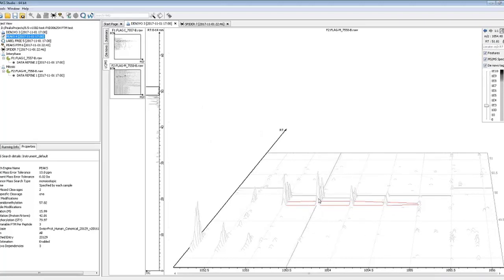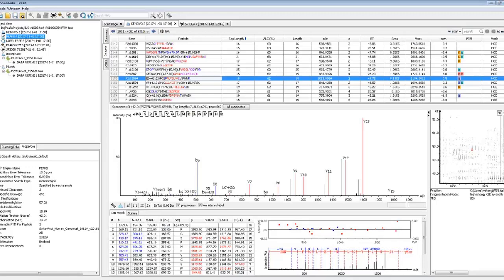of the mass spectrometer. And the area highlighted by this shape shows the peptide feature associated with this de novo result. And the idea here is once we actually calculate the area of this peptide feature, this is what's shown in this area column, which gives you an idea of the de novo results coming from the most intense signal coming out of the mass spectrometer, which then gives you an idea of which peptides are actually the most abundant peptides in your data set. So I could use that to do some semi-quantitative analysis, which I'll show you in the other parts of PEAKS.